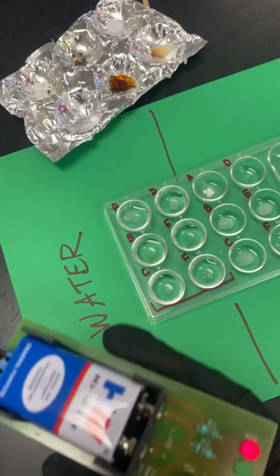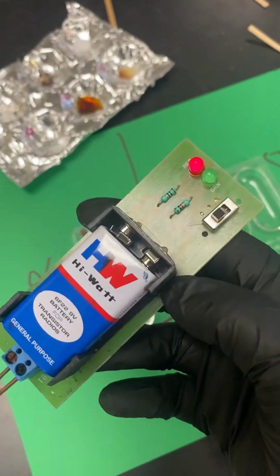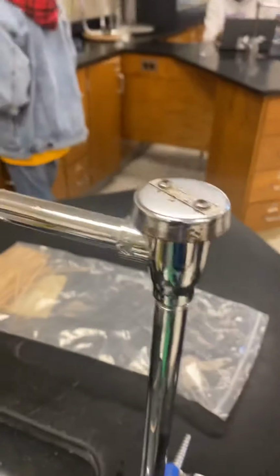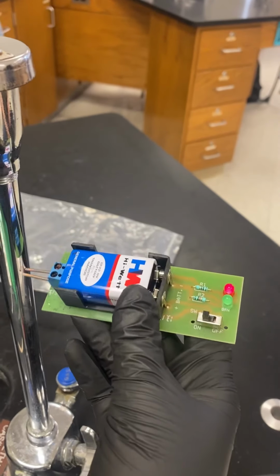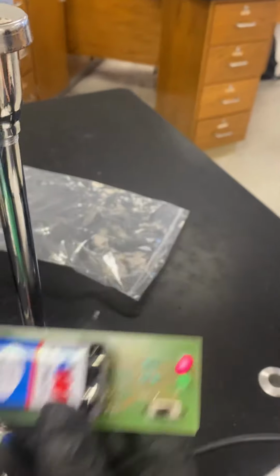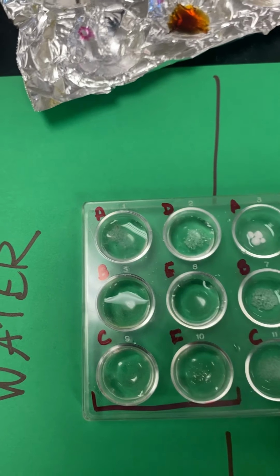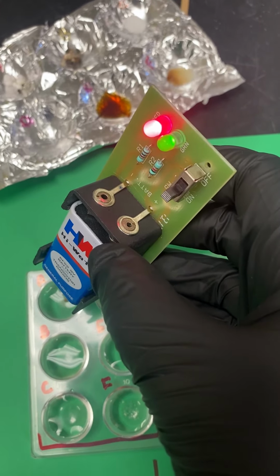Okay, so for our last test, it's going to be the last column of your data table. We're using a conductivity meter, and it's going to have a little light flash when the solution conducts electricity. So we know that it works because this is metal. If I put it on there, you can see it light up. There you go. All right, so let's come here to our calcium chloride. And that's a positive, it lights up.